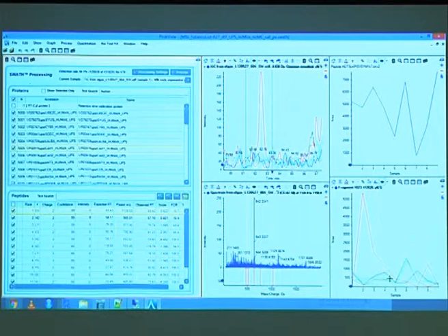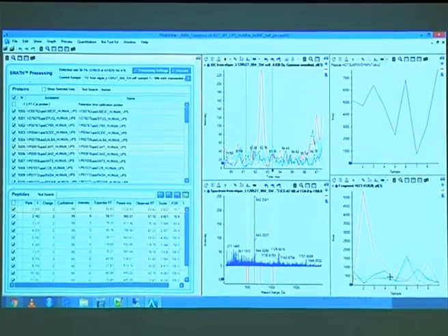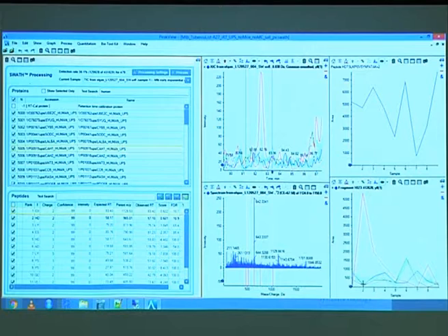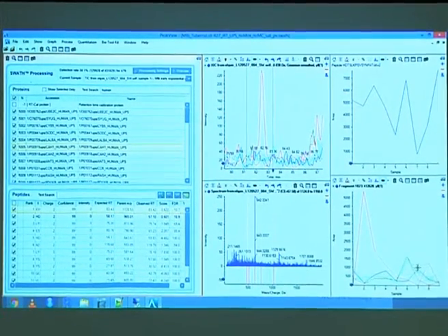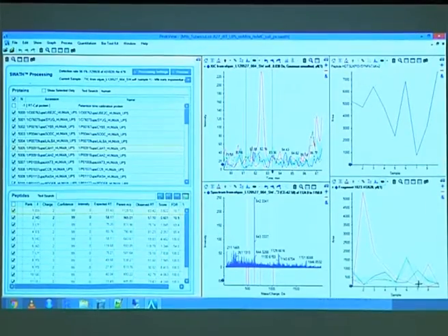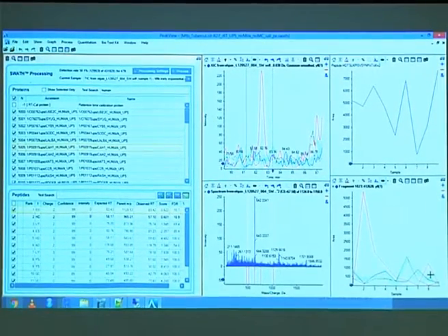And now see, this is how that looks. So you see here in the fragment, most of them, it's not nice and steady. It's not even changing in the same way as it would if it were dynamic. This is just a mess. You see, in this case, you have the purple way up and this color again up here, and the blue is the lowest, and then here the blue is the highest, and the purple one is the lowest. So that's not good.